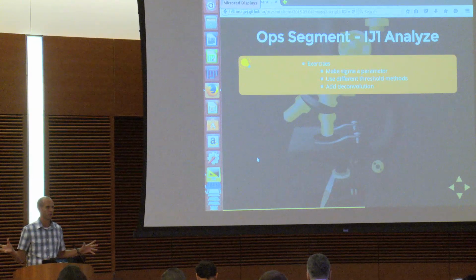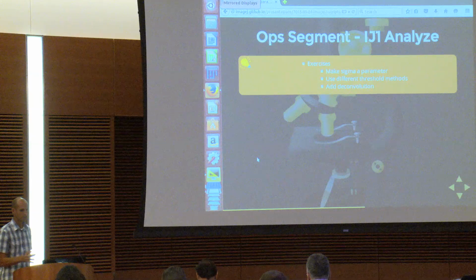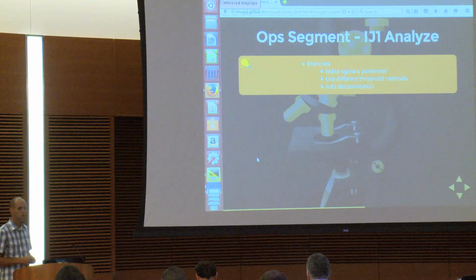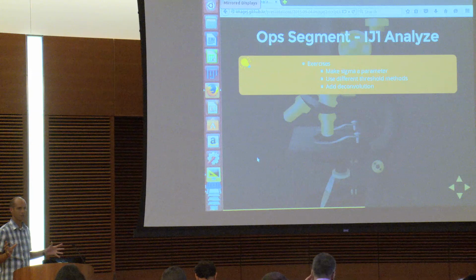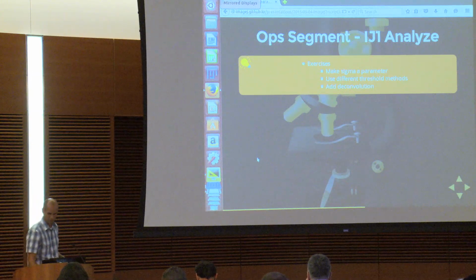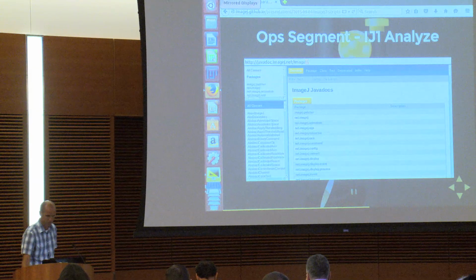Okay, any questions about that step? Okay, so the next little exercise is to use a different threshold method. For this we really need the documentation. In the presentation, I reused Curtis's slide, so I have documentation here, I think.